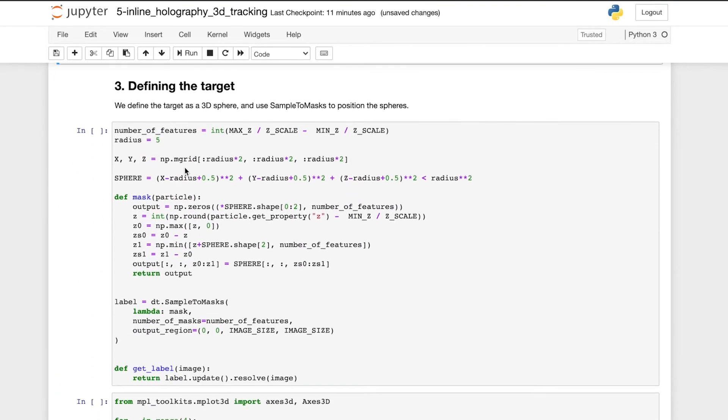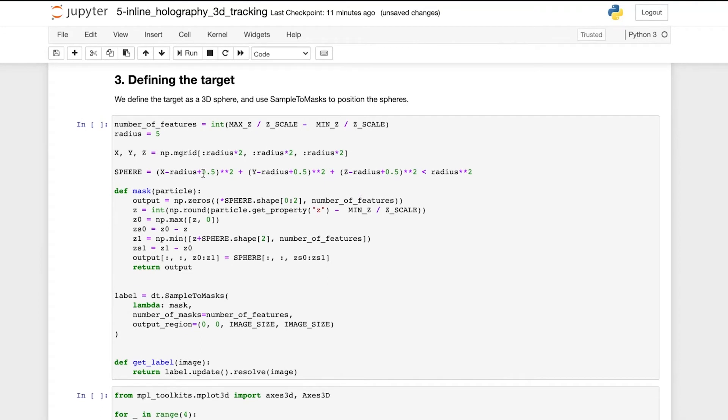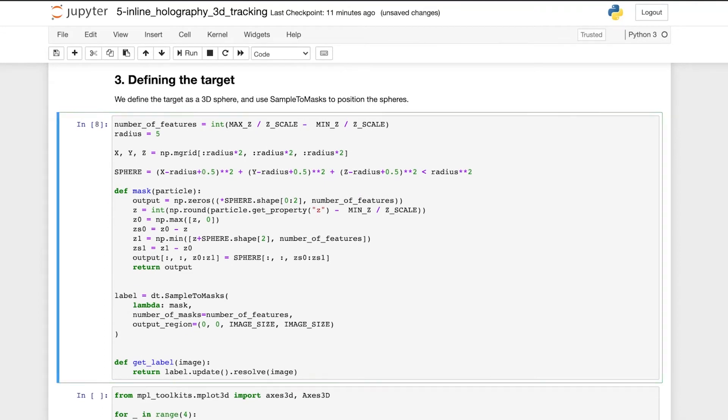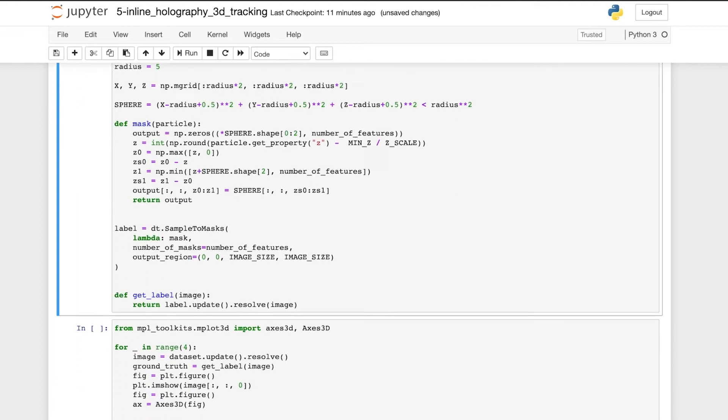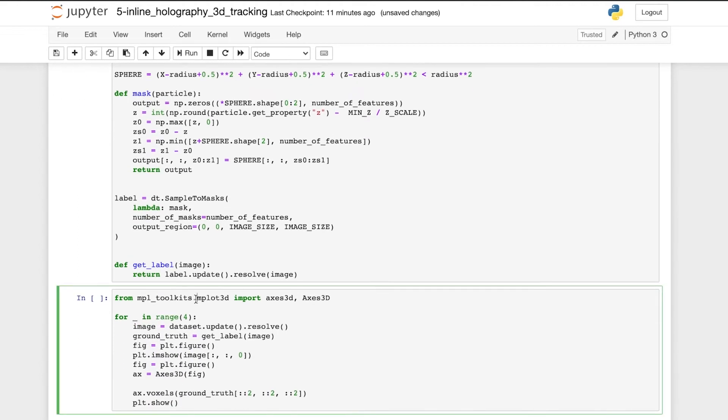We then define the training label as a mask of the images, where each particle is represented by a white sphere with a radius of 3 pixels in a 3D volume. And here we can see a few examples of the training data.